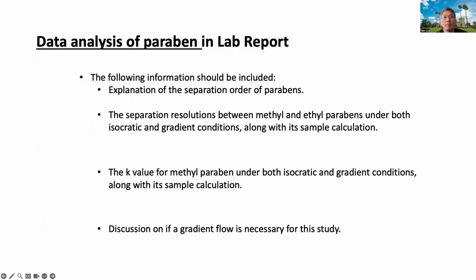Once the time and width are determined, you will use the formulas mentioned here to calculate resolution, retention factor, and the ratio of delta T over Tg to determine if a gradient run is needed or not.